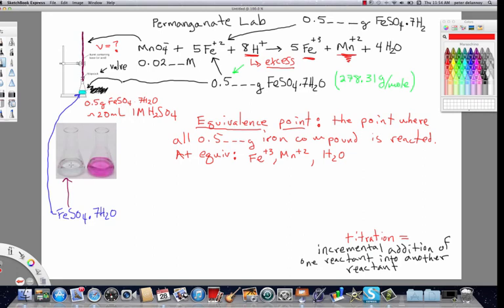And at the point where you see that start to happen, the smart chemist is going to shut this burette down. And what you're going to do is start washing in using distilled water. You're going to start washing in fractions of drops.